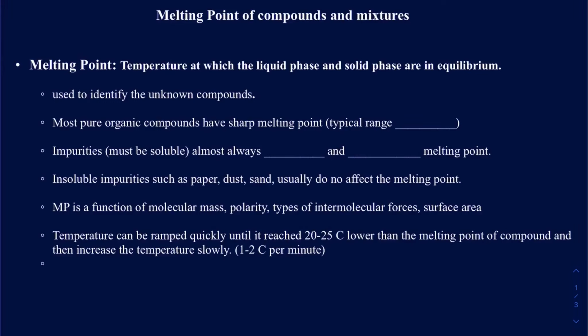Hello everyone, in this video we're going to be talking about how to determine the melting point of compounds and mixtures. In addition to that, how to use melting point to determine the purity of the compound and also to determine the unknown compound in a given sample.